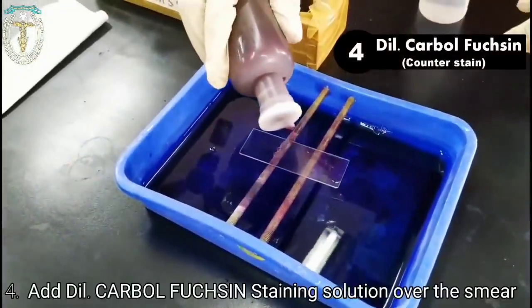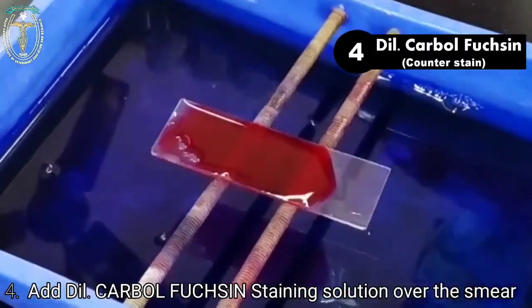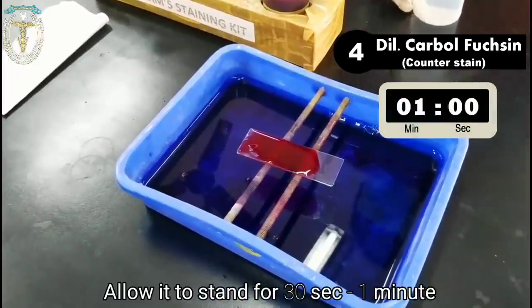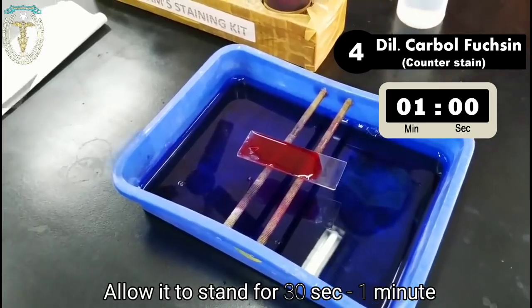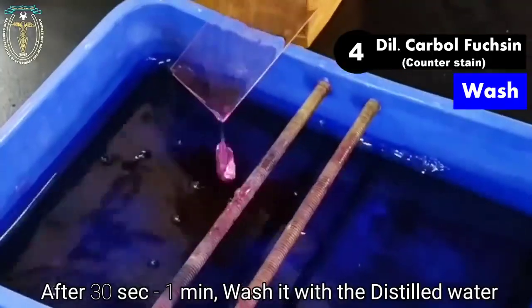Lastly, add the dilute carbol fuchsin staining solution over the smear. Cover the entire smear with the staining solution and allow it to stand for 30 seconds to 1 minute. After 30 seconds to 1 minute, wash it with the distilled water.